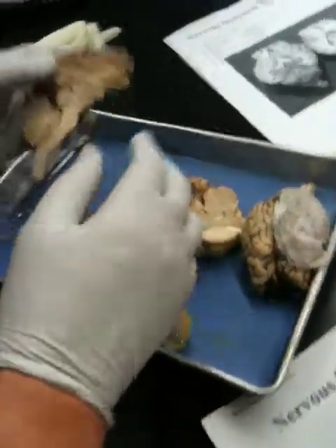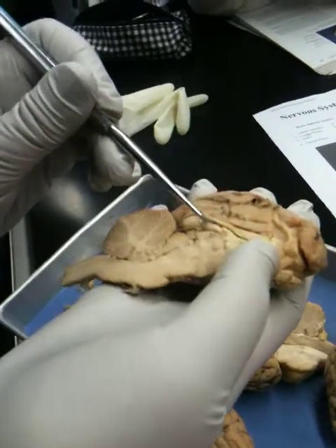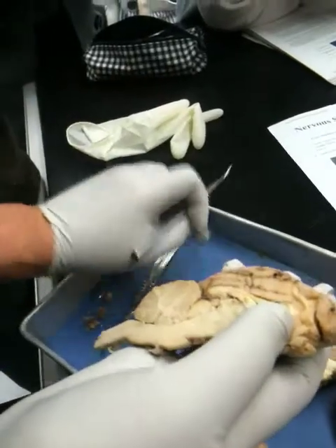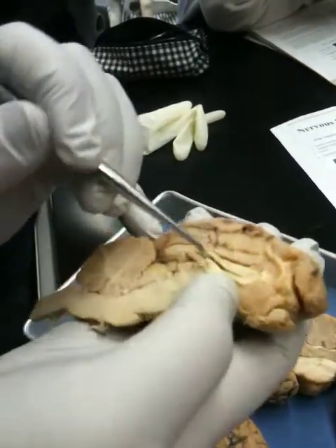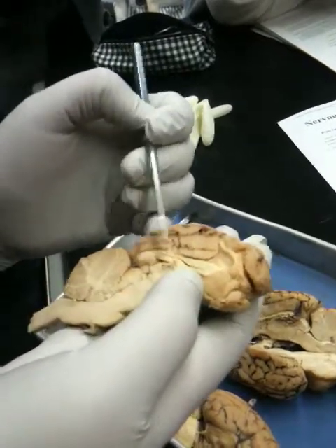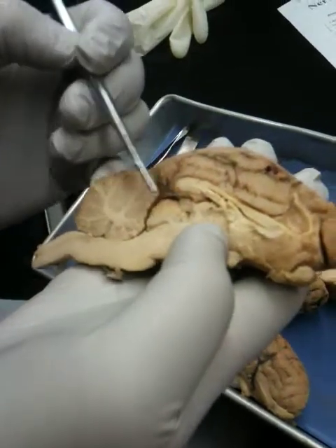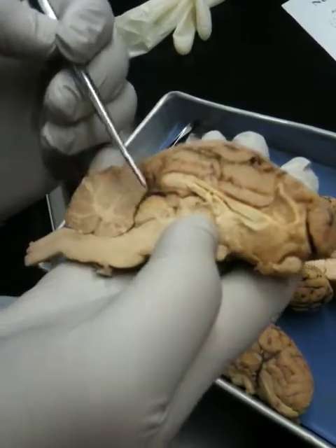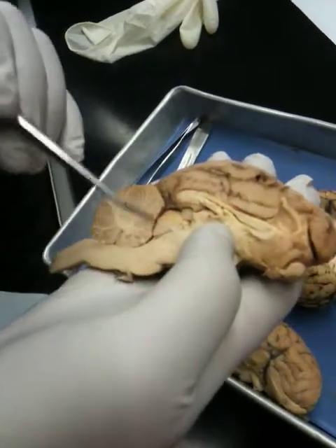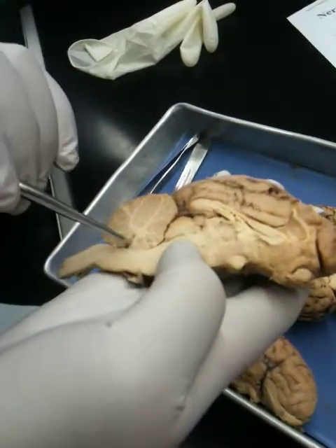Now let's look at your brain — yours is nice too. I'm just separating that so you can see. That's the lateral ventricle. Remember, a ventricle is a space. This is the corpus callosum. This is the fornix. This is the pineal body, so that makes this part of the corpora quadrigemina, and you can see the superior colliculi and the inferior colliculi. This is the fourth ventricle.